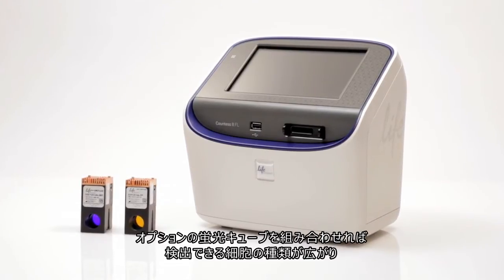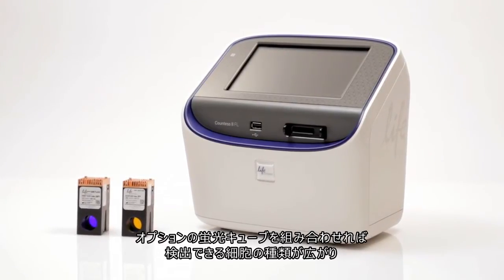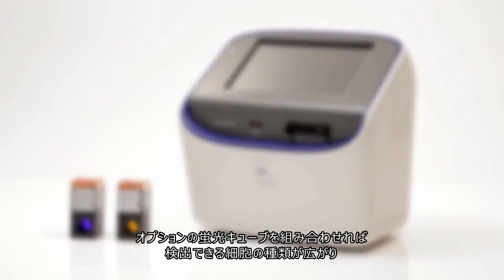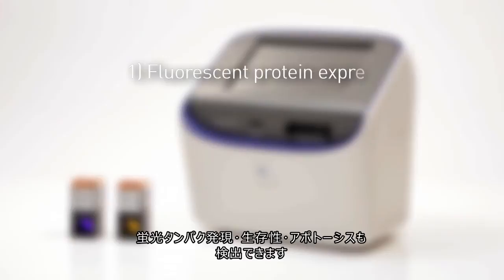By adding optional fluorescence light cubes, the Countess2 FL automated cell counter can be configured to perform a variety of fluorescence applications, including fluorescent protein expression, cell viability, or apoptosis.